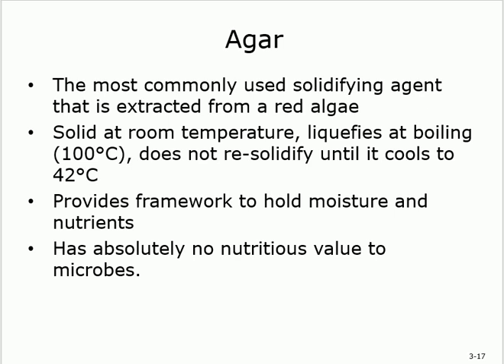Remember it? Agar, algae. They get it from the red algae. The most important component in agar or red algae is the polysaccharide. So what do you mean by solidifying agent? What exactly is it going to do? Why are you adding that to the medium?